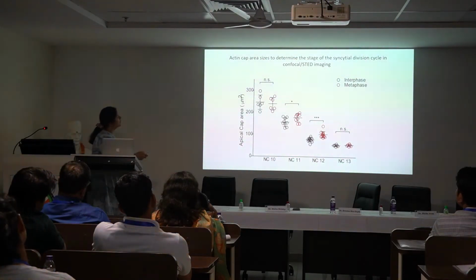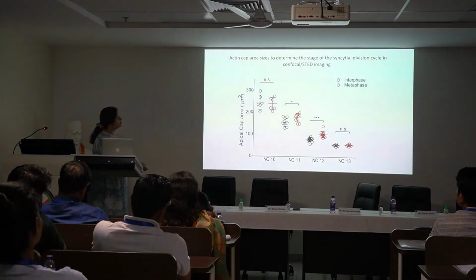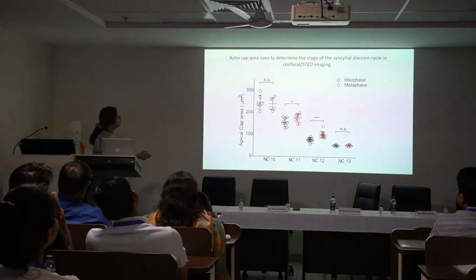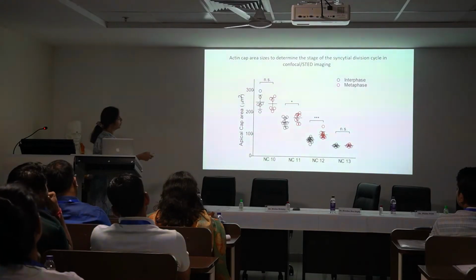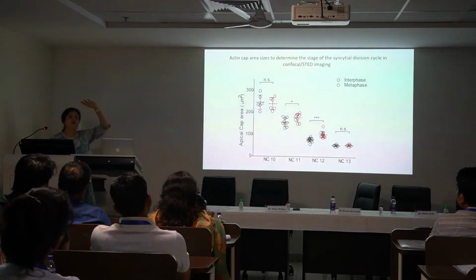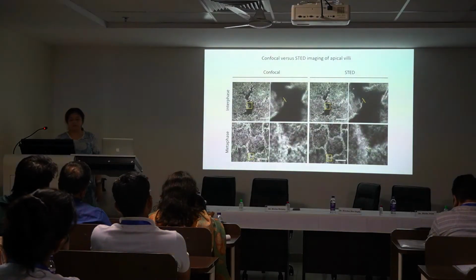We can look at this, and for our sake we had to figure out which cycle it is, right? So just by figuring out the area of each cell, we can now say that if the area is around 250 square microns, then it is in cycle 10 and so on, right? So these kinds of quantitations allow you to document better the stage of development that the system is in.